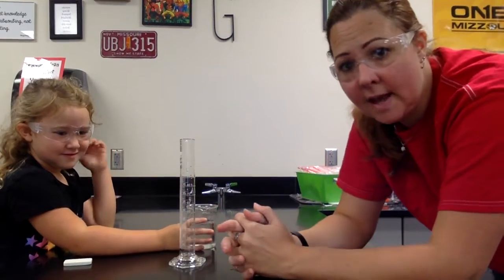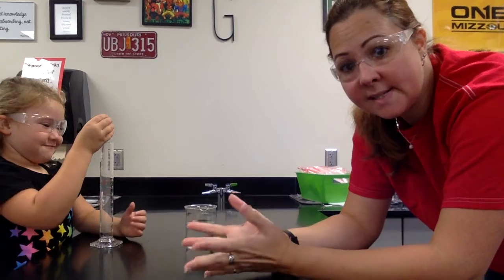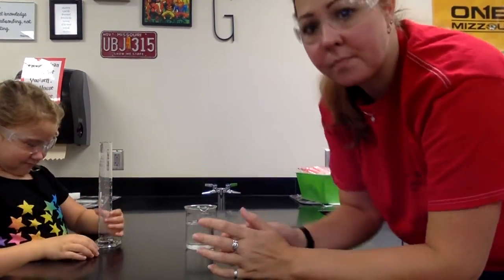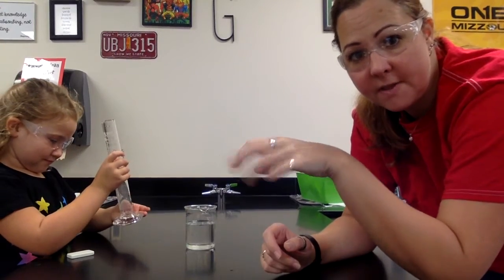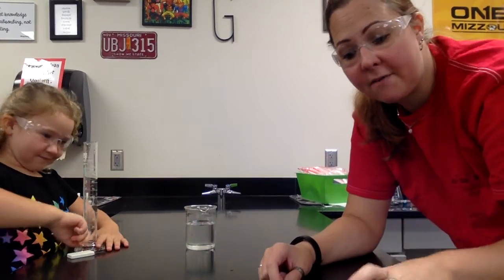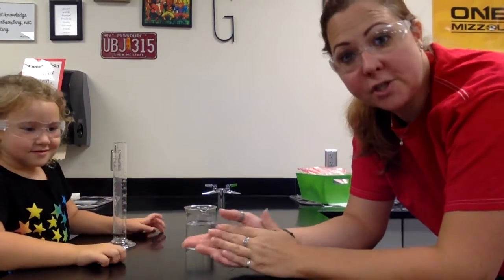Now your task in the lab today is to do the data. So I gave you all of the, that's glass. Can you put it down, please? All of your data is given to you, but you're going to have to do the math. When you do the math, you're going to find the density, and you're going to have to find the volume of the different objects either by subtraction in milliliters, or by taking your length times your width times your height to get your centimeters cubed with your ruler. From there, you have a few questions to answer, and you'll just submit that when you're done.